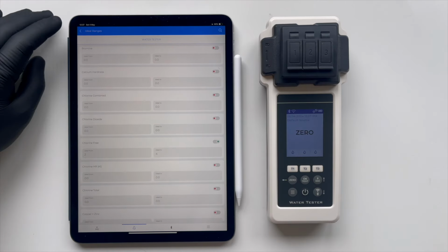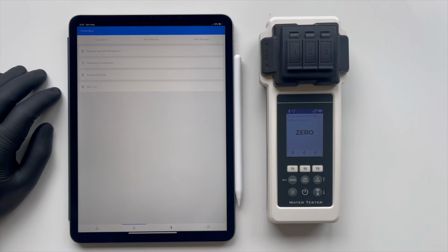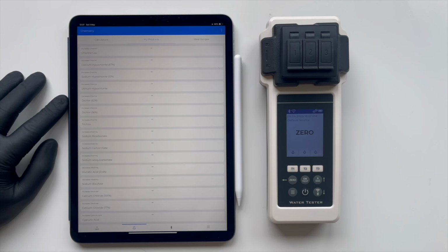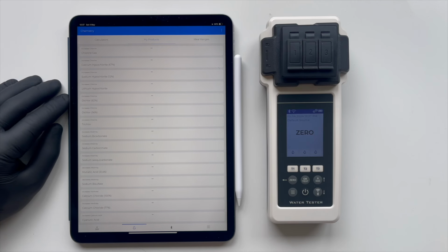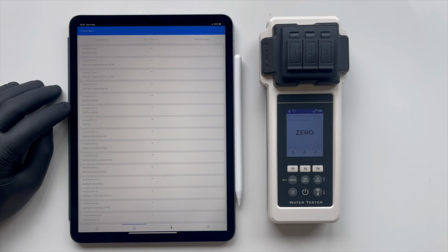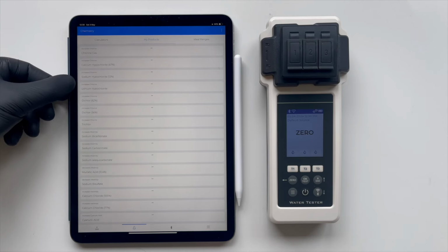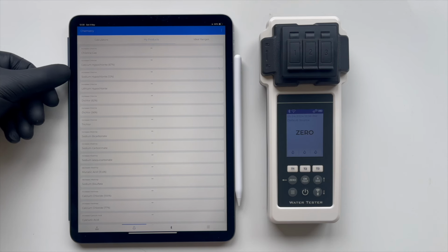Next, you need to add the products you use in the My Products section to adjust various chemical levels. We have already added all as chemical elements. In your case, you will have specific brands that you use, and you must enter these data manually. This process allows for more accurate and tailored chemical management, as different brands may have varying concentrations and effects. By inputting the specific brands and quantities you use, the app can more precisely calculate the necessary adjustments to maintain optimal water quality.